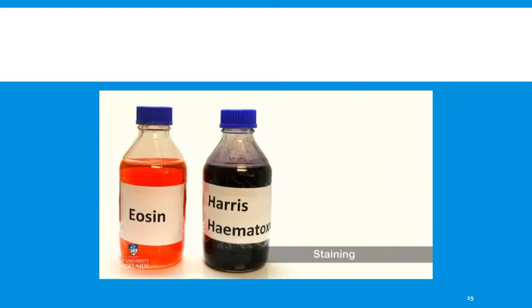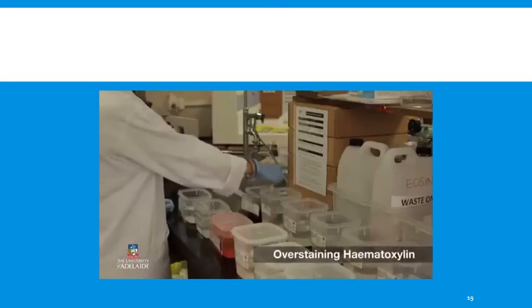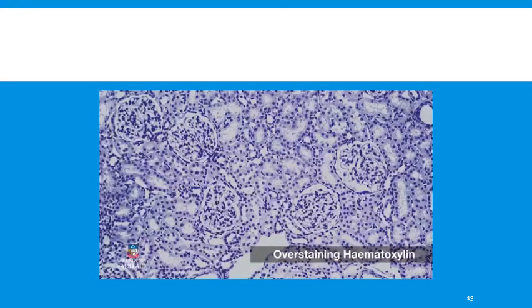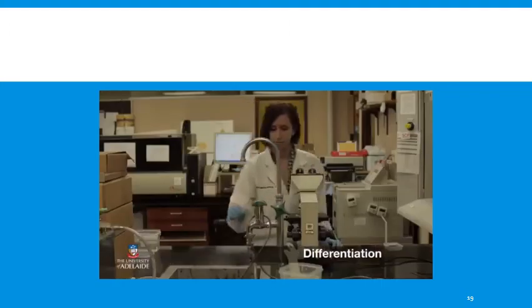Hematoxylin and eosin are routinely used to stain histological sections. Hematoxylin stains many nuclei a blue to black color. Eosin stains cytoplasm and intercellular components pink. Sections are overstained in the hematoxylin solution. Overstaining with hematoxylin results in many tissue components being colored blue. The dye is then selectively removed by 1% hydrochloric acid solution until the nuclei can be seen clearly. This process is known as differentiation and is checked with a microscope.